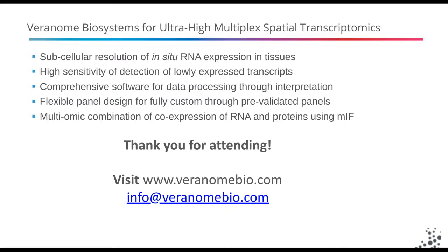Another part of our webinar series is going to be walking through our image analysis process, including the segmentation results. What we've been doing is benchmarking our algorithm to some of the open source or published segmentation algorithms out there. So with that, I'll let Brian tackle the next step.